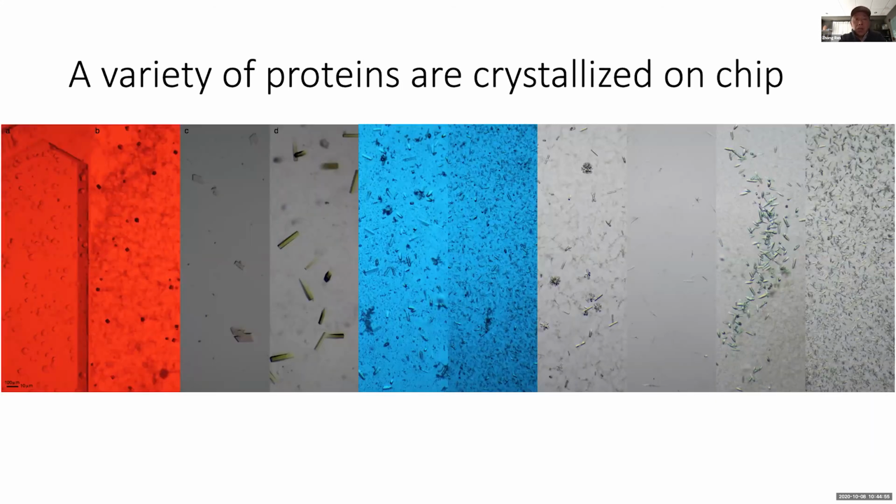But of course, in the future, we are experimenting with different designs of the device to retain the advantage of the design, but to introduce either vapor diffusion or hanging drop.